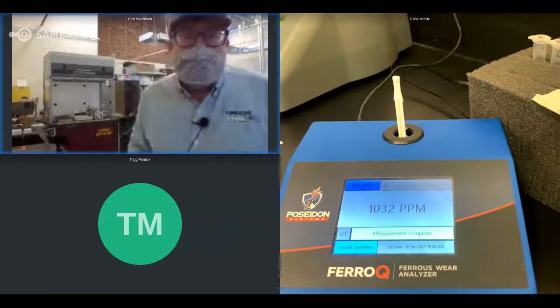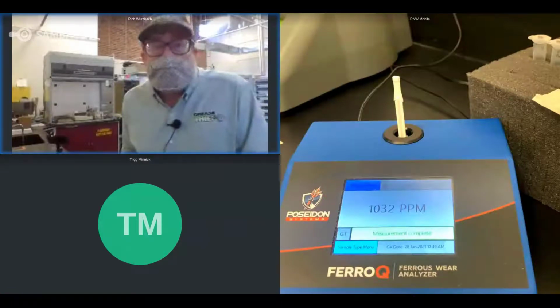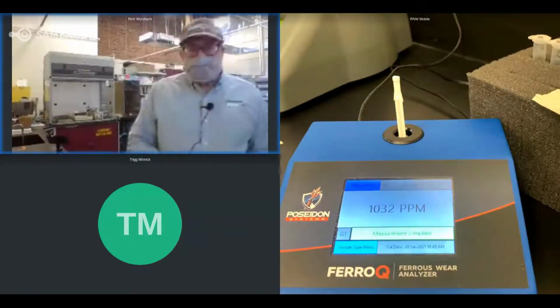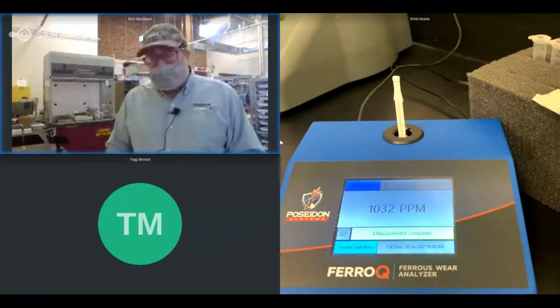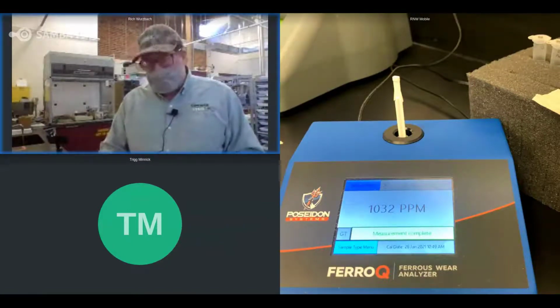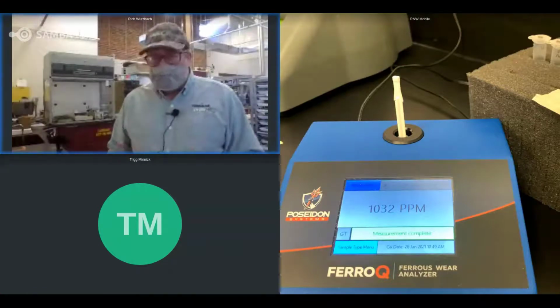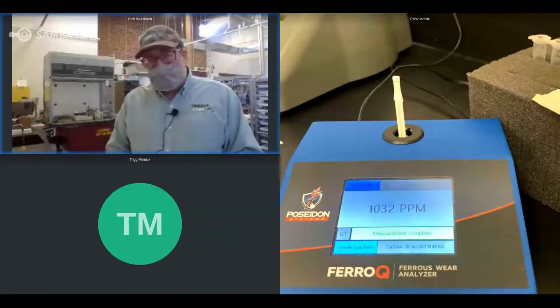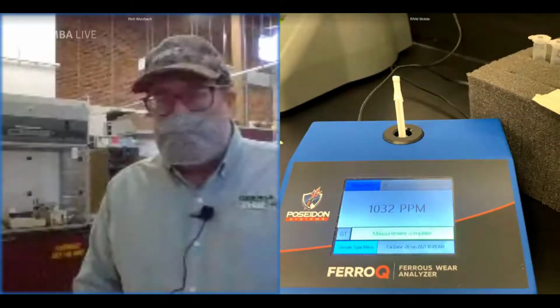You have a baseline measurement, and what is considered low and high, or is it dependent on the customer to read the data and look for outliers? Good question from Jared there. So we've been doing this analysis for almost 10 years now, and we've looked at a lot of different applications: pharmaceutical facilities, mining applications, power generation, including wind turbines, robots. And so over time, we've developed some values that we see as being typical, and even created some general guidance for values for action: what's considered acceptable, what's marginal, and maybe what needs a further look.